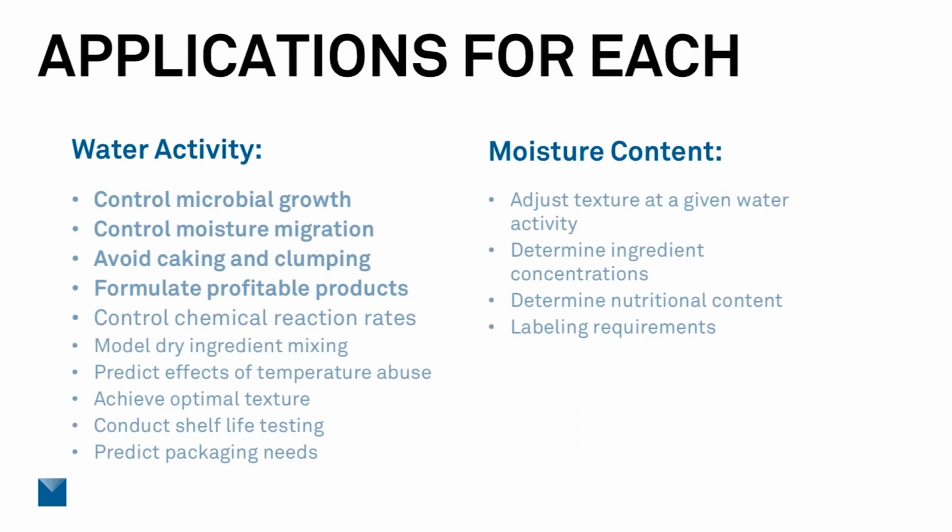Now, there are applications for both water activity and moisture content. I want to briefly put up a list, but I'm not going to read through it right now, and you're welcome to review it in the future. The slides, as Brad spoke, will be made available to you. I will be focusing on the top 4 for water activity, hopefully touching on number 5, which is controlling chemical reaction rates. For moisture content, I do want to say that it does affect texture.